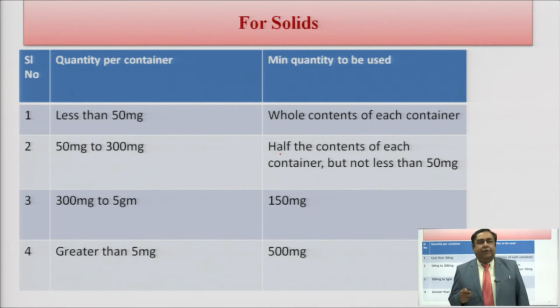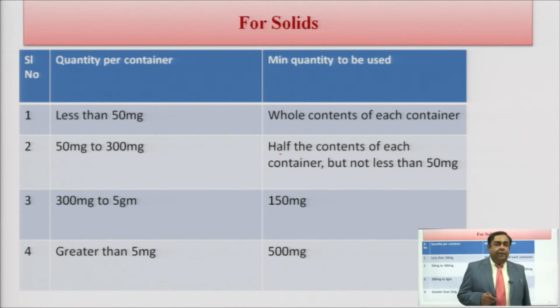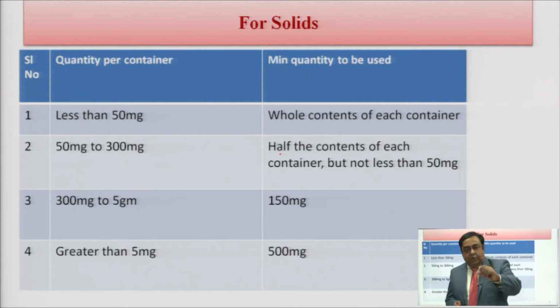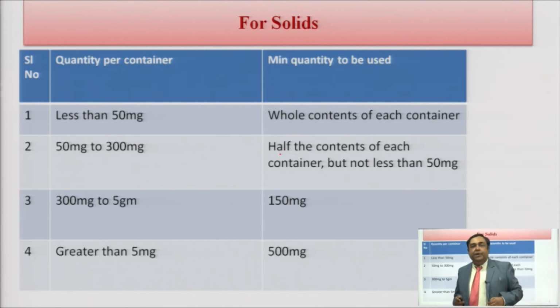If the content ranges from 50 milligram to 300 milligram, you have to take half the content of the container, but please keep in mind that it should not be less than 50 milligram.